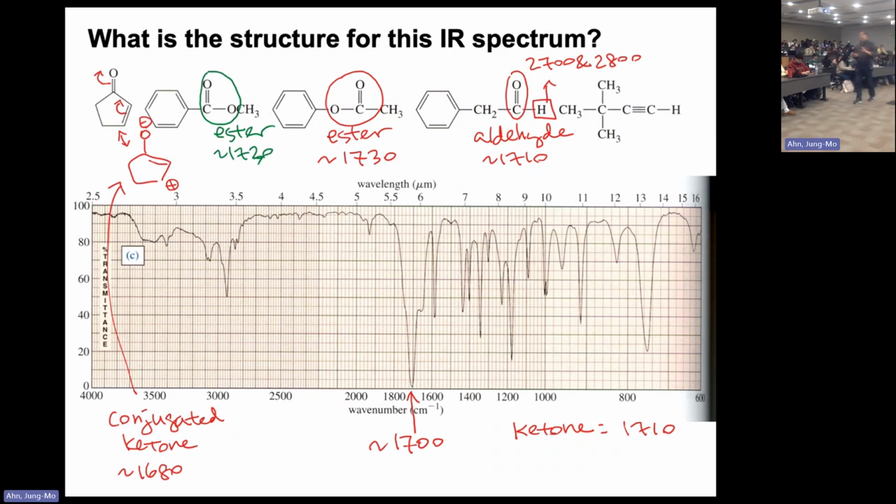I mean, that's most likely what you guys think. But this is what makes things complicated and what you need to figure out. This carbonyl has a benzene next to it. What that means is this looks like a conjugated carbonyl right there, right? So they can make a resonance structure.